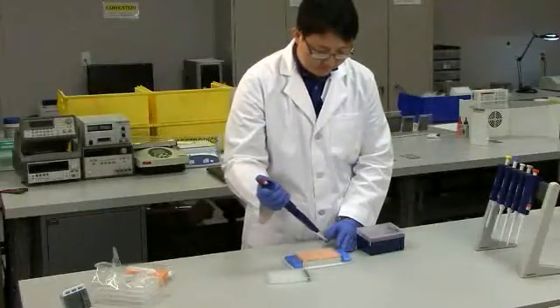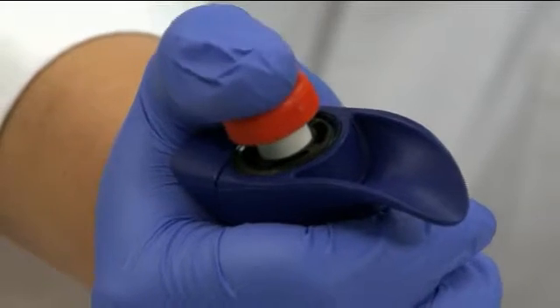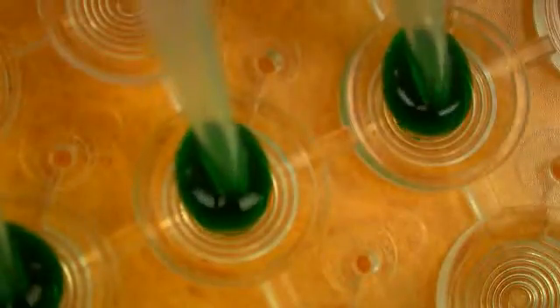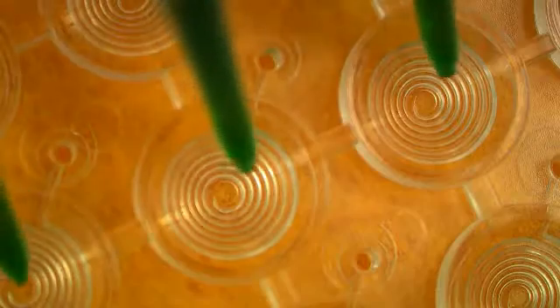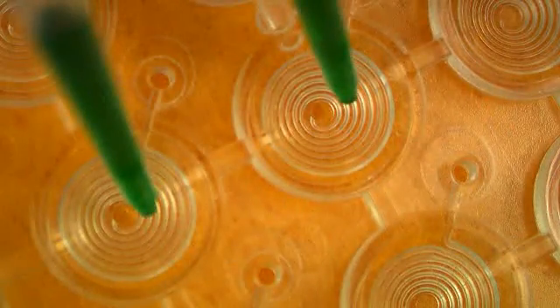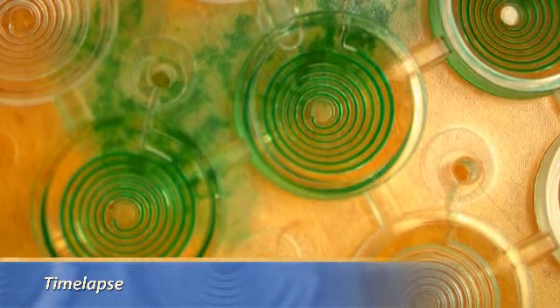Now let's see what happens if you don't follow this simple recommendation. A common pipetting mistake is to dispense beyond the first stop and push all the liquid out. When you do this, you inject air behind the liquids, and this generates air bubbles in the wells, which impedes reagent flow and can cause assay failure. Following this simple pipetting guideline and using samples and reagents free of particles will ensure consistent results from the Optimizer microplate.